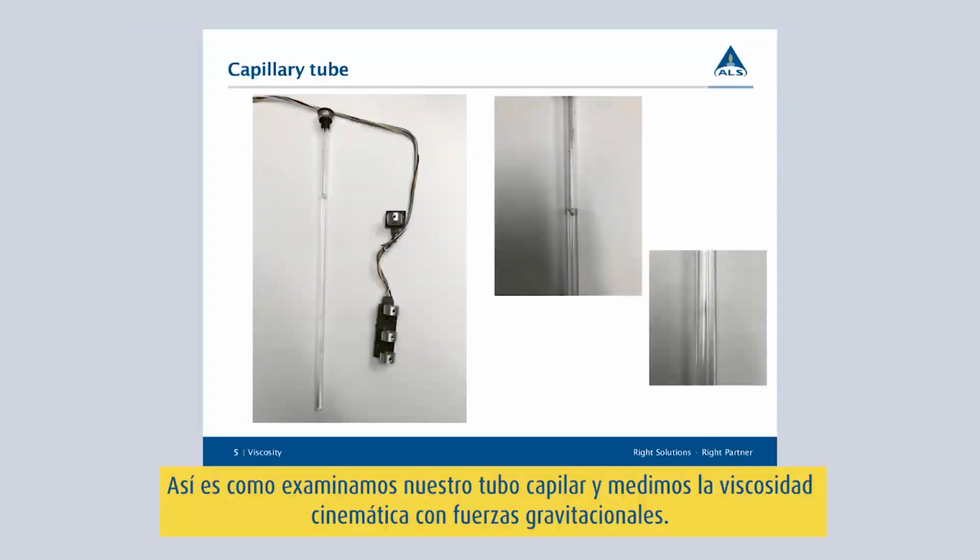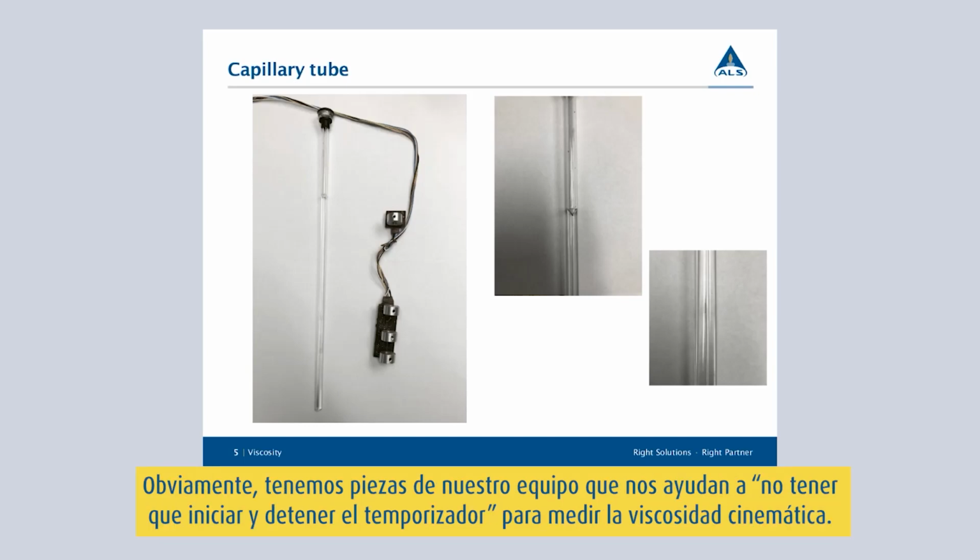And so that's why it's gravitational forces. We obviously have pieces of our equipment that assist us in running it, so we don't just have to put it in, start a stopwatch, and stop a stopwatch.